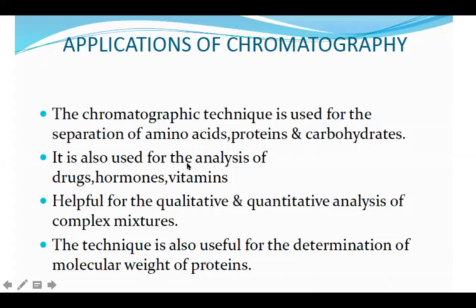It is also used for the analysis of drugs, hormones, and vitamins, helpful for the qualitative and quantitative analysis of complex mixtures, because HPLC and some other chromatographic techniques are used to quantify the compounds present in the mixture. The technique is also useful for the determination of molecular weight of proteins, because some chromatography is used to determine the approximate molecular weight of a protein.